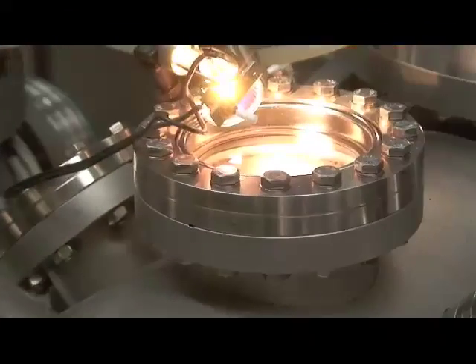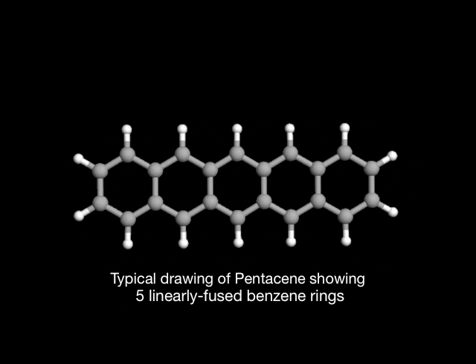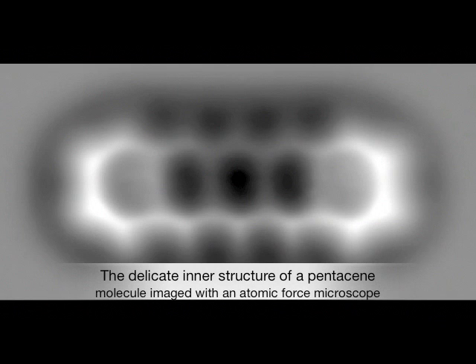Pentacene molecules. IBM scientist Fabian Mohn comments, "We are investigating single molecules, and probably everybody knows from the chemistry class in school that usually the chemists, they have these pictures, how they draw the molecules, these models. And with our work we were now able to really image these molecules like they appear in the chemistry textbooks."